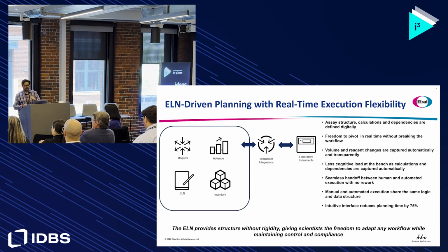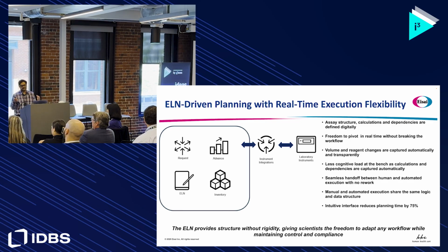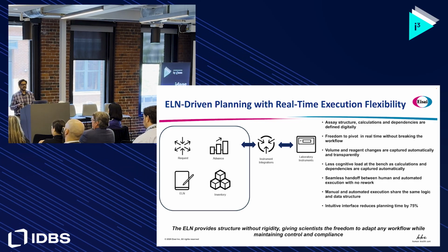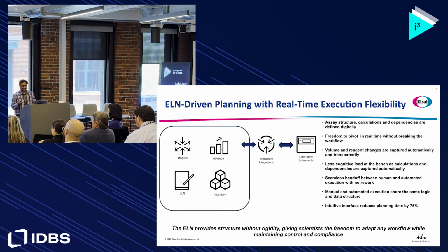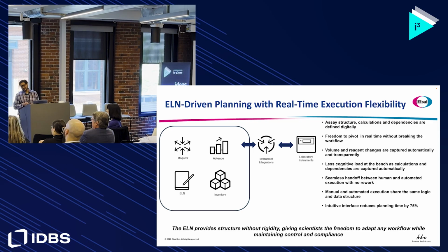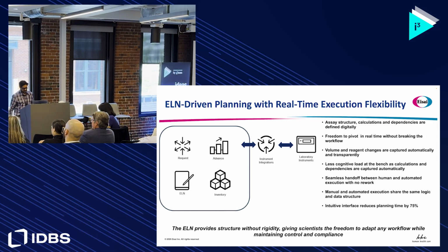And sometimes in the past, when we built out these workflows and we made templates, they were really rigid, and you could only do one thing. And then if something happens at the bench, you're stuck, right? Then you have to pull out of that template, then do some manual explanation of what you have to do, and it breaks the workflow up. We don't want to do that anymore.